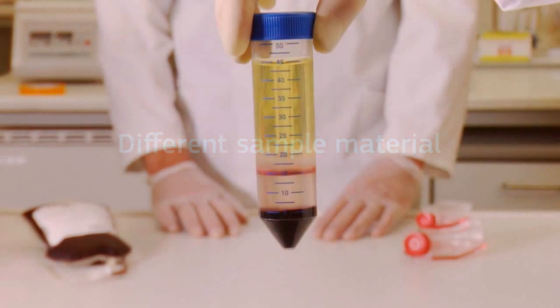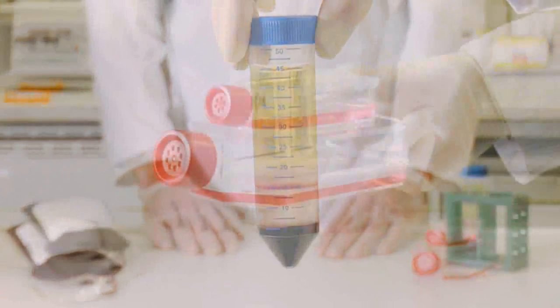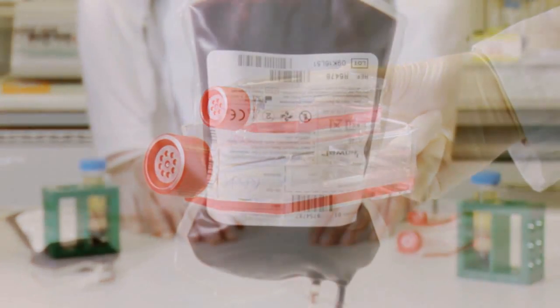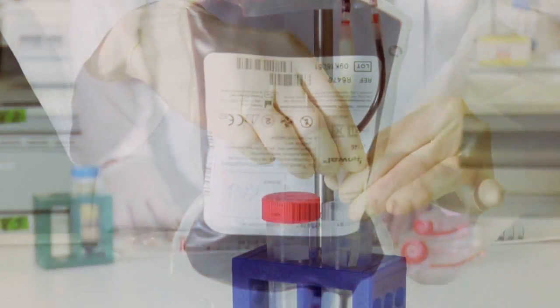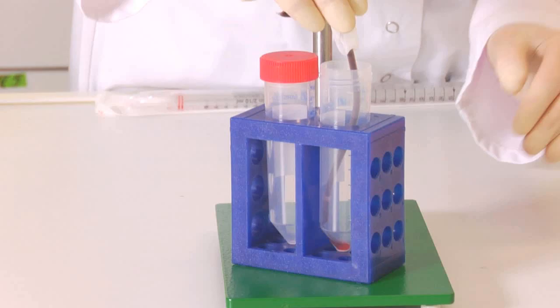For example, from the familiar buffy coat, from cell cultures, and even from untreated whole blood. This is how the method works.